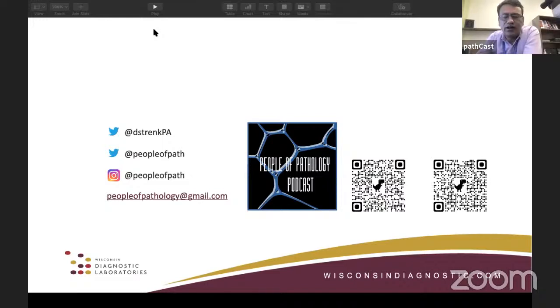Right. So another viewer has added in the chat box that Johns Hopkins has a free online grossing manual, which is pretty good. Yeah, there are a few others. I think UCLA has one. University of Chicago has one also. They're all good, and especially for our viewers who have joined from countries other than the USA, please go over these freely available online resources, which really have good guidelines for grossing. And it cannot be overemphasized that grossing plays such an important role in pathologic diagnosis of tumors, especially, of course.